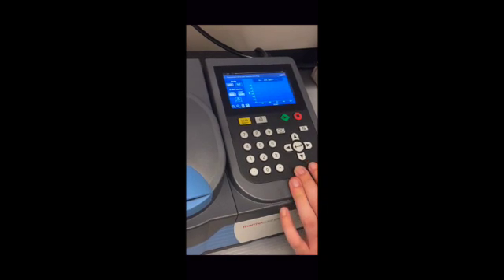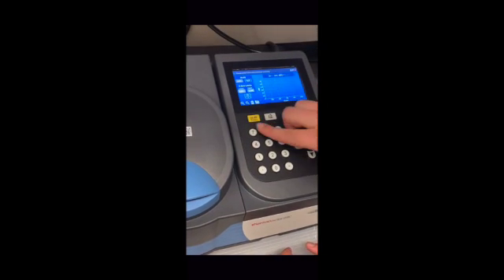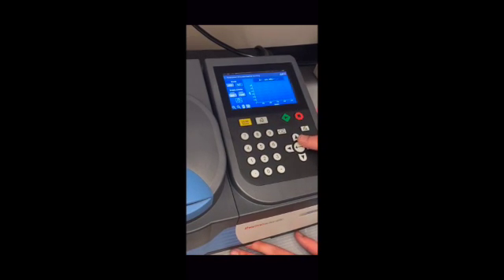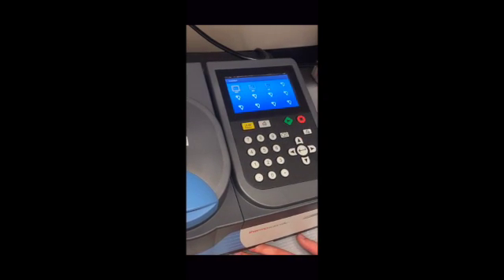And now that you're in scan, you have to make sure that your blank is inserted. And if you notice up at the top corner, it says press this button to start baseline recording. You'll press this button, and it'll read the baseline. Once your baseline is read, it'll save it, and you'll go back to the home screen, and you'll go to Smart Start, and your option should be pictured here.